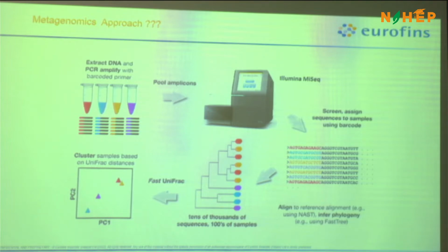When we are doing amplicon-based sequencing, we decide on a gene marker like 16S or ITS. We take the marker, we assign a barcode along with it so that we can differentiate between the samples, and then we sequence. So we have the Illumina adapter, and we have the primer sequence ahead of that, and we have the indices, which we are showing you in different colors, 4 colors shown here.